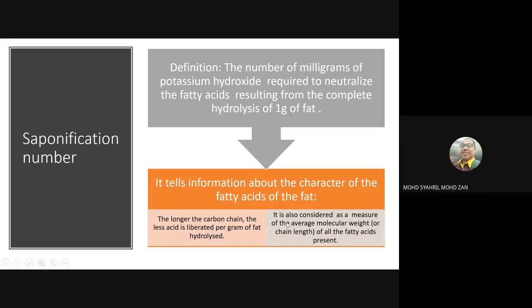Number one, we can know the information from there. We can know the longer of carbon chain. Berapa panjang kita punya fatty acid tu, dan berapa lama kita perlukan masa untuk kita hydrolyze. Okay, setiap fatty acid berbeza. Dia ada panjang dia. Kalau lebih daripada 36, masa lamalah proses kita nak putuskan dia, dan mungkin pengurangan asid tu akan dijalankan dengan lama, lambat.